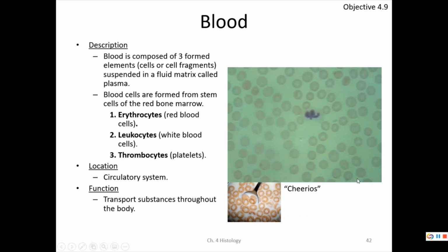These look like Cheerios floating in milk. Leukocytes, white blood cells, and that's one right here looking like a fly that fell in our blood. Almost looks like a cowboy hat. I want to put that on. Something's like, what in coagulation? You don't see the what in tarnation meme that much anymore, but I like dead memes. And then thrombocytes, that's our platelets, tiny little fragments seen around in the blood.